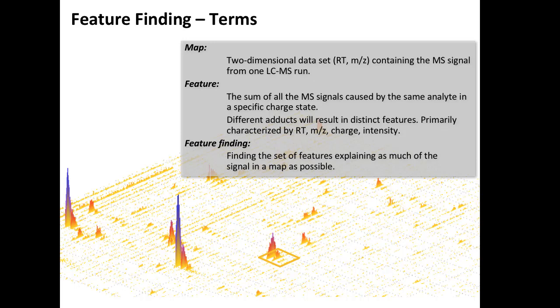So getting rid of or measuring blanks is actually something that is good. It gives you some idea that you should not over-interpret if you see a small blip coming off that. It doesn't mean that it is in your sample. It just means that it's in your mass spectrometer, and there are different ways for that to get there.